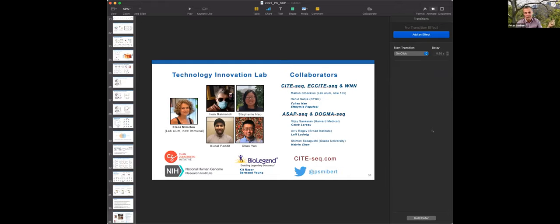And I think this is why ASAP-seq works nicely, because the chromatin in ASAP-seq is still locked up nice and tight in the nucleus. It's not really labile. DNA is pretty stable. It's not really able to float away and join the soup, leave the cell behind. So I feel like it's an easier nut to crack than combining with RNA-seq. But Hattie's done a good job doing this, and I'm sure she'll speak to this as well.